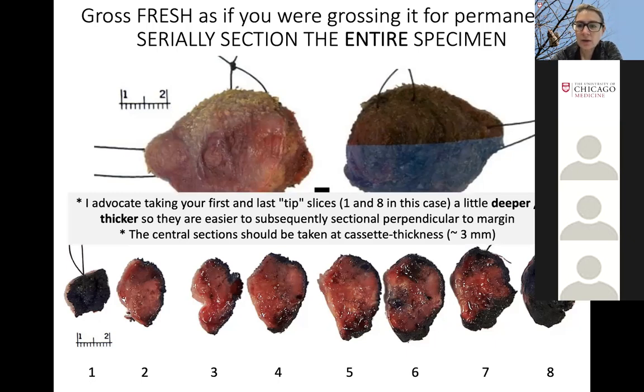They who? ENT surgeons. So they only asked about that because I suggested it as a technique for people who are uncomfortable sectioning fresh specimens to help firm up the tissue. I know that they were quote unquote asking for it before, but that was because I had discussed it with some of the residents regarding facility of sectioning. So I don't think they have been mentioning it, but I'm going to talk about why we may or may not use it.